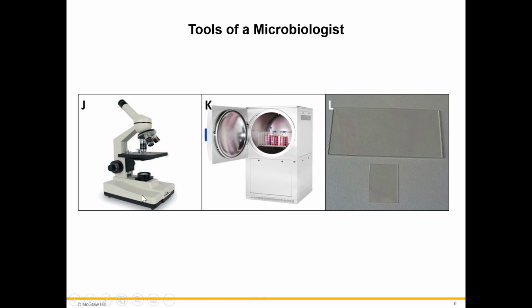This is a microscope, which is the predominant focus of this lecture series. A microscope is used to visualize microorganisms. This is an autoclave. An autoclave is used to sterilize substances.